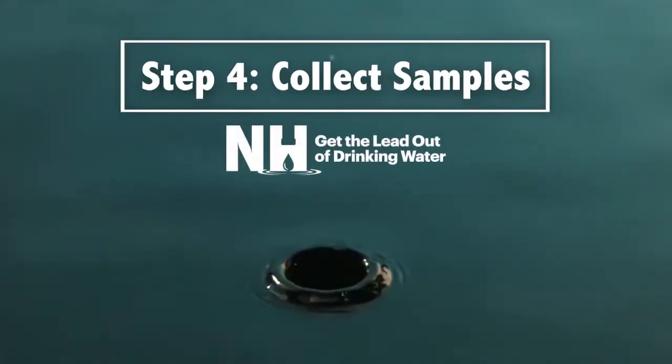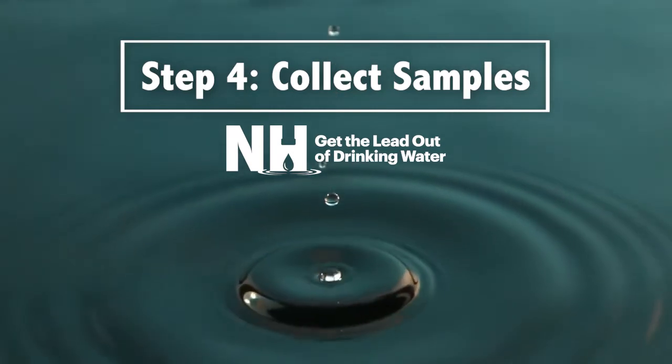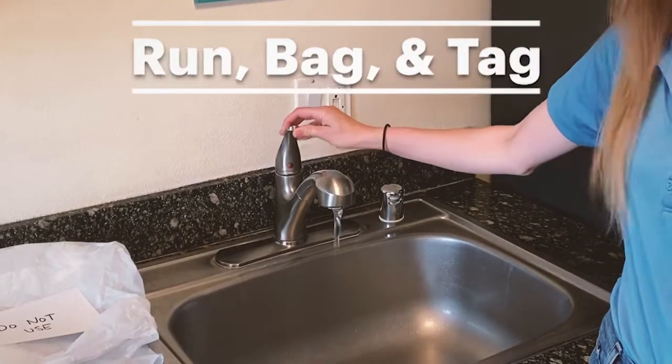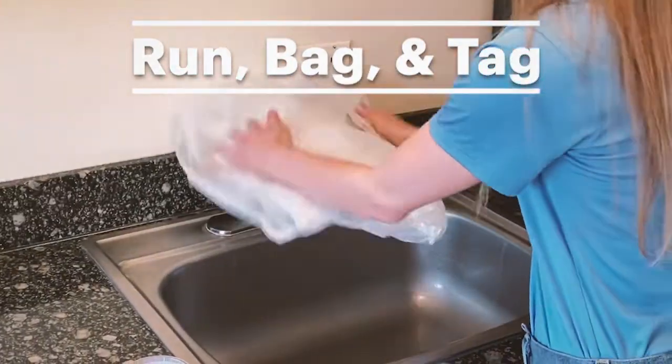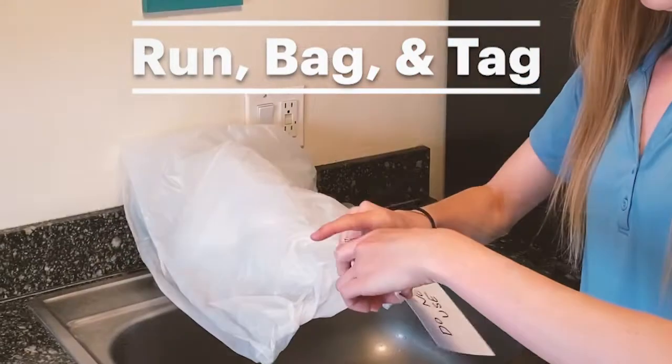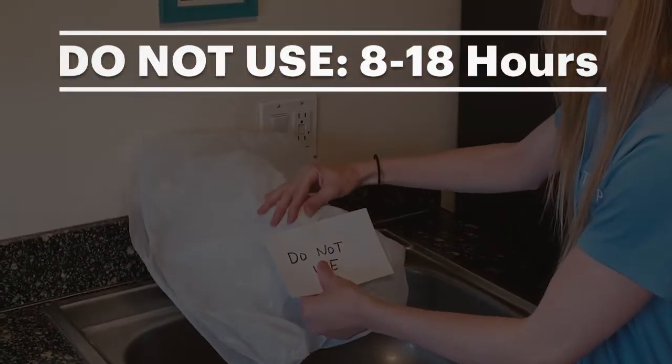Let's learn how to collect a drinking water sample. Before samples can be collected, the steps outlined in the Prepare for Sampling video must be completed. This includes the run, bag, and tag process where you run the water, place a bag over the outlet, and attach a Do Not Use sign to ensure that the water is not used for 8 to 18 hours before you collect the sample.